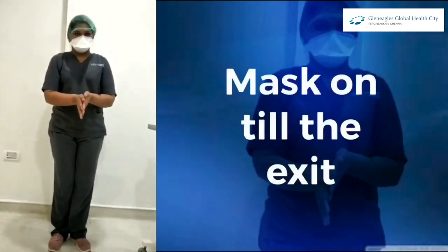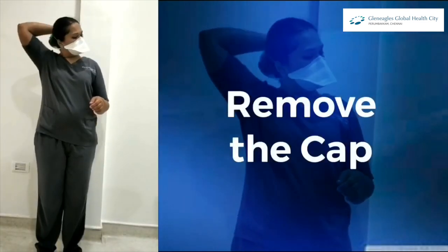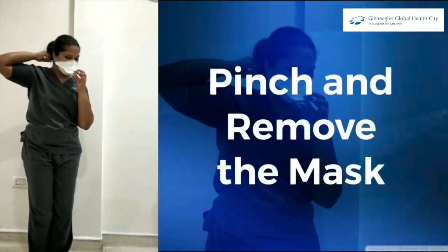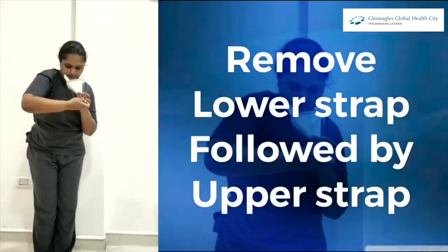The mask should be kept on until you are out of the COVID zone. Now remove your cap, then remove your mask by pinching it, bending forward, and removing the lower strap followed by the upper strap.